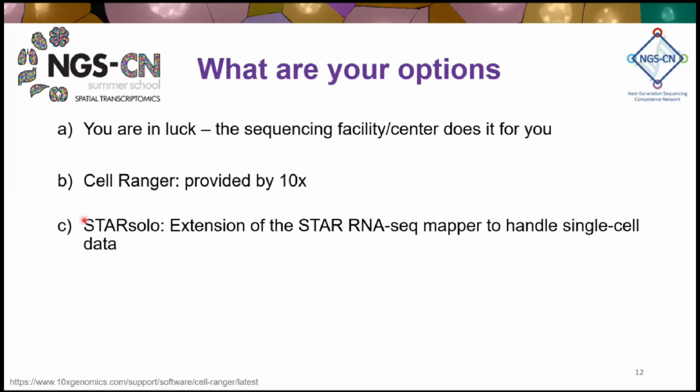so that the mapper can handle single-cell data. STARsolo is faster. The drawback here is you have to set it up for your data, and there are more options to configure and so on.